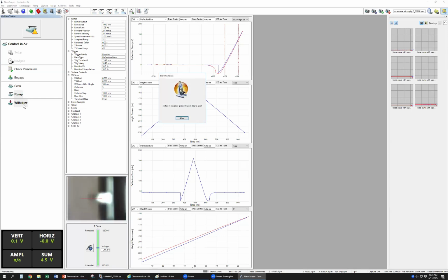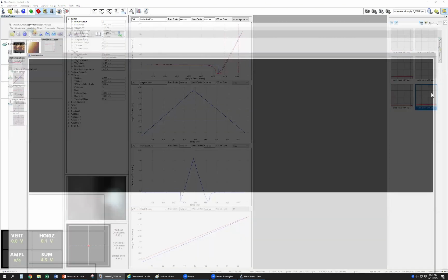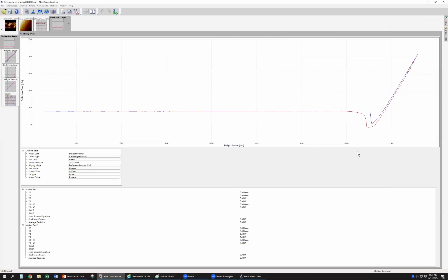This one is one method. Because we collect the five images, this one is from the real time, because we didn't withdraw, right? Even with the offline software, we have this function. Okay. So for example, we open one curve; the offline software is the same. If you use this one, then you just draw these cursors from the left side to the right side, get the slope area. Here have the command update sensitivity.